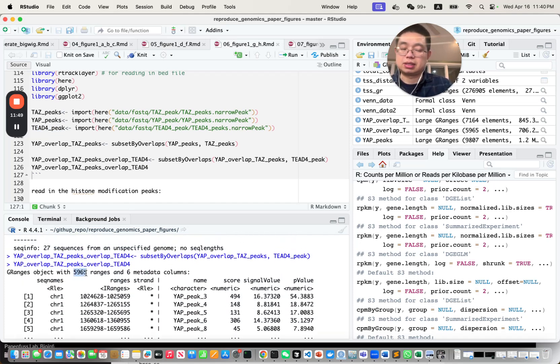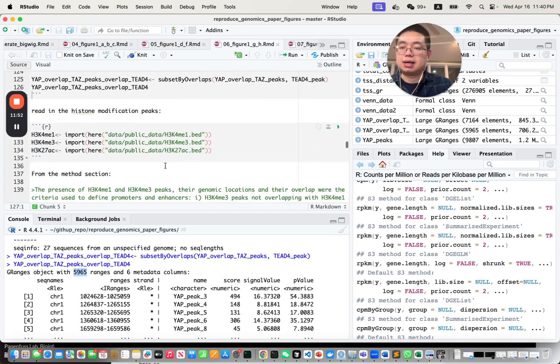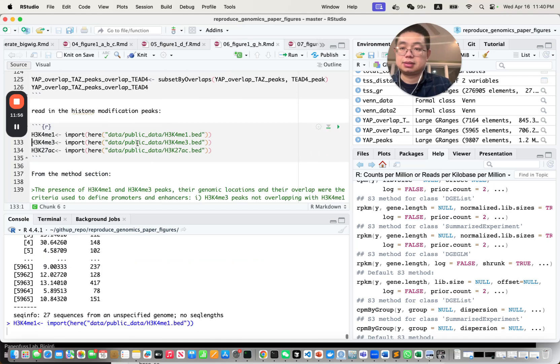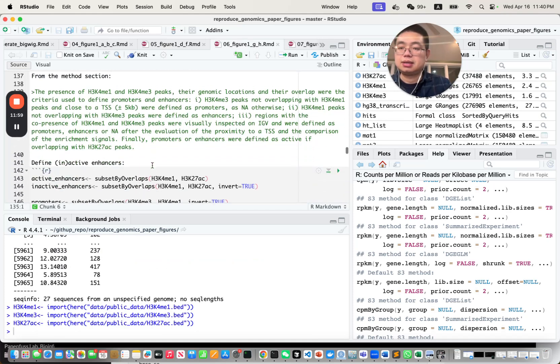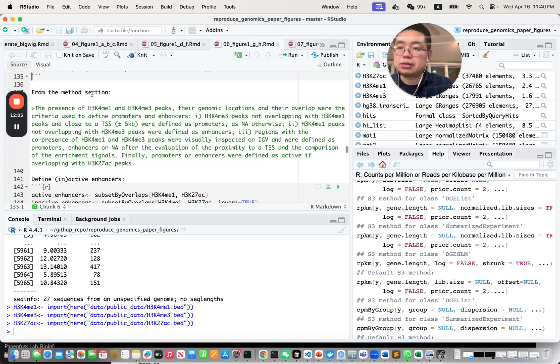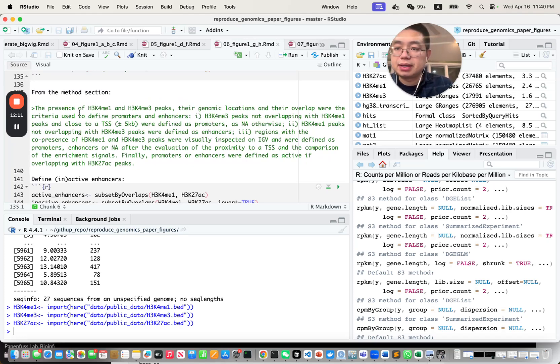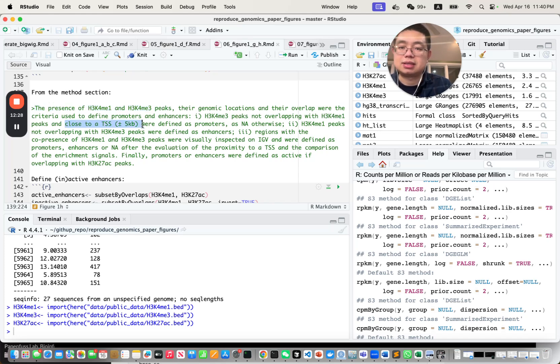Now we read in the histone modification peaks using the same import function. From the methods section, here is how the authors define enhancers and promoters: the presence of H3K4 monomethylation and H3K4 trimethylation peaks. If it's H3K4 trimethylation not overlapping with H3K4 monomethylation peaks and close to a TSS, those are defined as promoters.